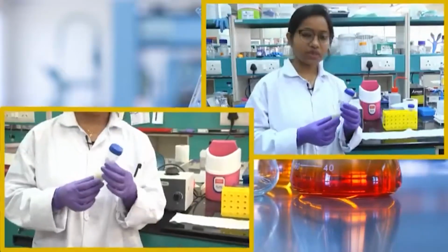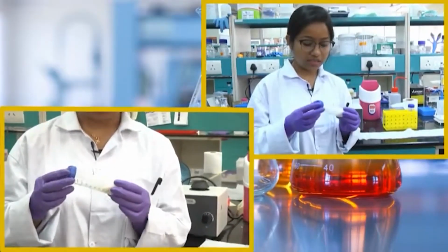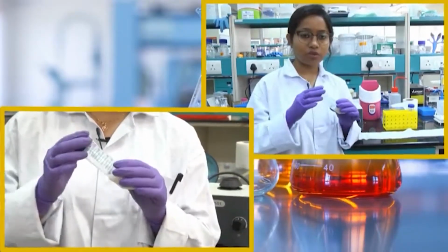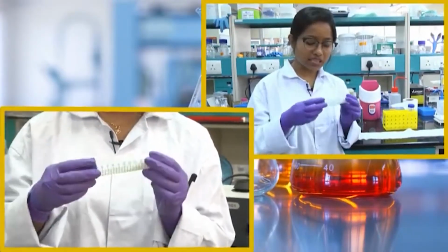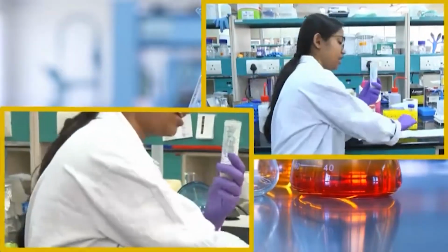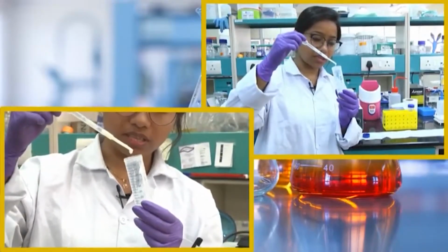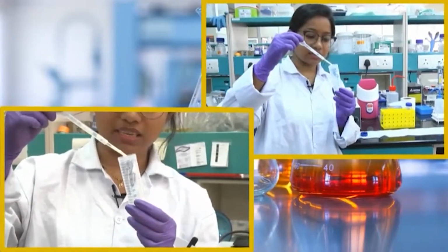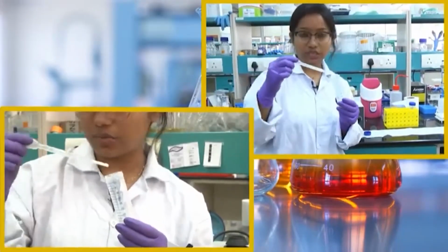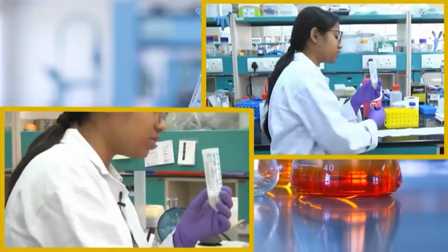So, after 20 to 30 minutes of the lysozyme being in the solution, you will realize that the solution becomes a little bit more viscous. It will try to stick to the side of the tube, and when you try this, you will realize that it becomes a little bit viscous. Before that it was kind of liquidy, so the viscosity was less. So, why does it become viscous?